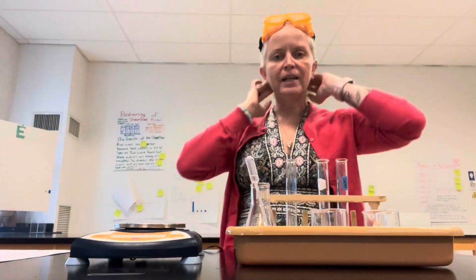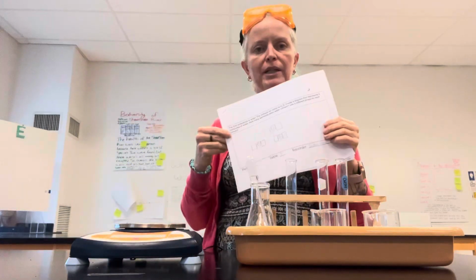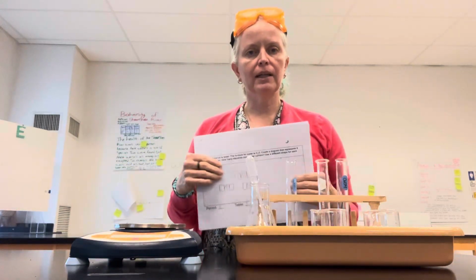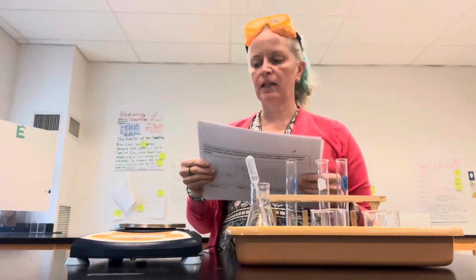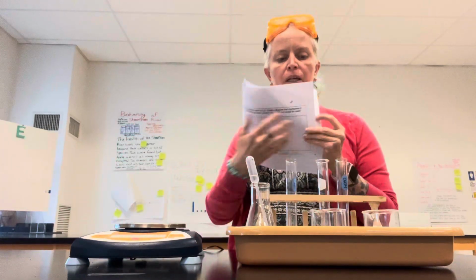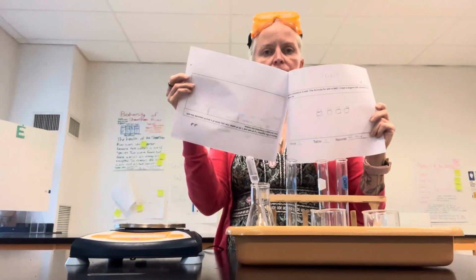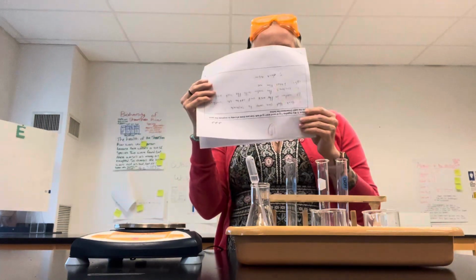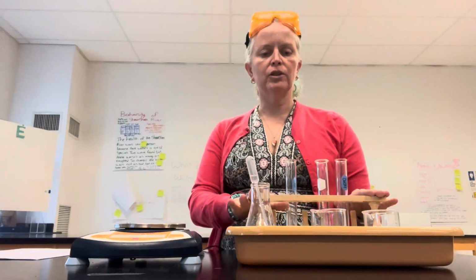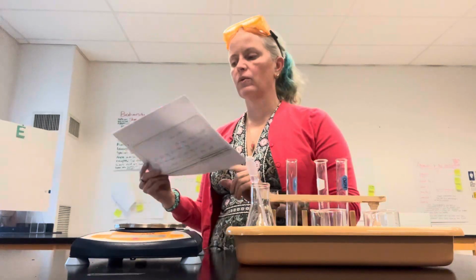Hi everyone. I just wanted to demonstrate the lab that we're going to be doing today that involves mixtures. This is a mini lab, so for this lab you'll be working together as a group to complete the 3 parts of the procedure. Each page will have a drawing task and then an explaining task, and then the other part of your grade will come from actually making the mixtures in the lab. So let me explain the drawing task first and then we'll work with the materials.